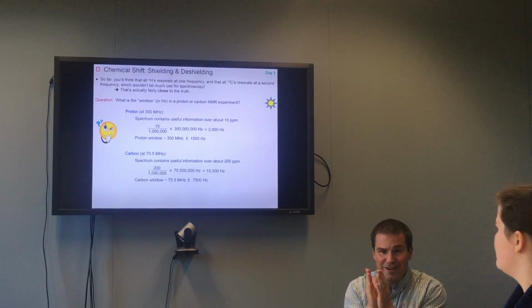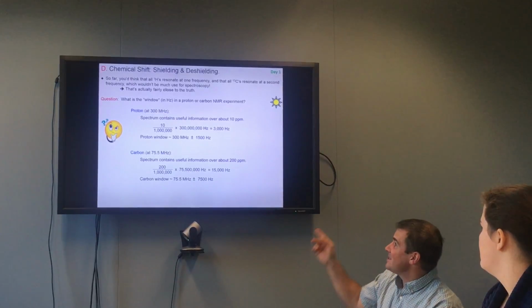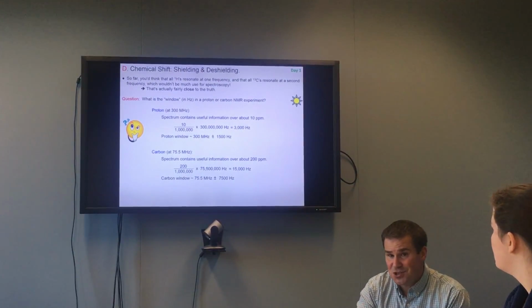So in other words, your error there is very small, right? To a first approximation, that thing that I set up at the top, all protons resonate at the same frequency. To a first approximation, that's true.